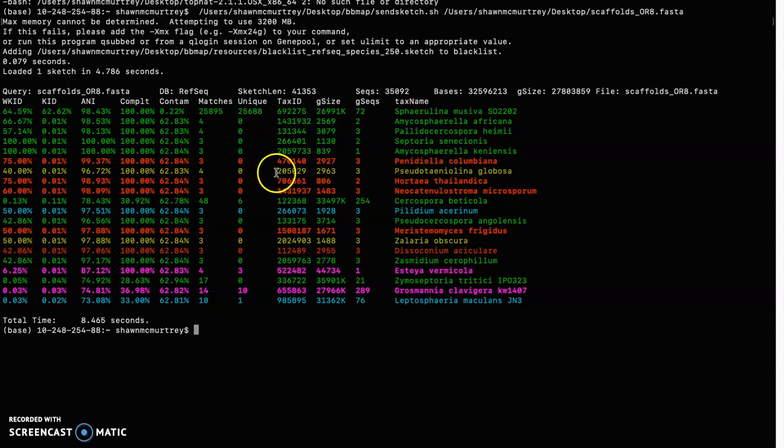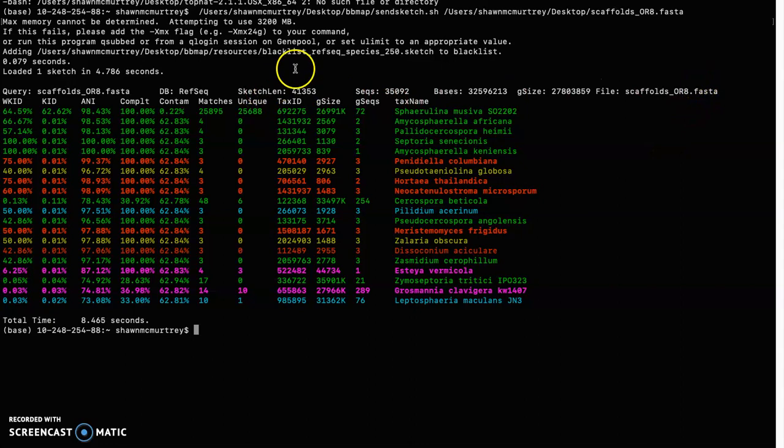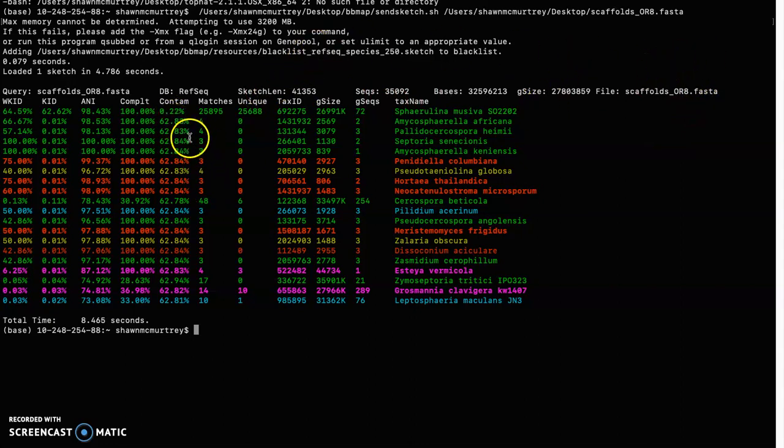Yeah, anyways this was a super easy program once you download it and it's just that one line. So it is a great tool to see if your genome is contaminated. All right.